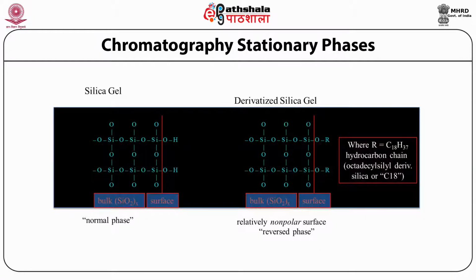This picture shows you how these silanol groups are derivatized chemically to make it hydrophobic. Now the surface hydrophilicity is getting converted into derivatized silica gel with different groups. Sometimes it is derivatized with an amino group, sometimes with a phenol group, sometimes with C18, C4, C8, C12 or C30. All these things are derivatized on the surface to give an interface of different polarity for separating compounds.